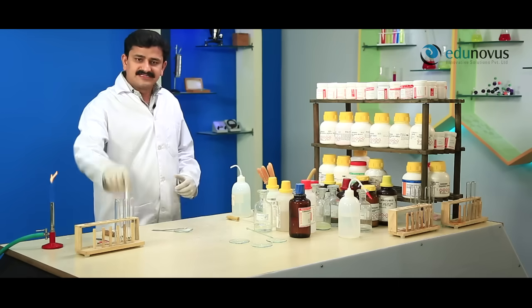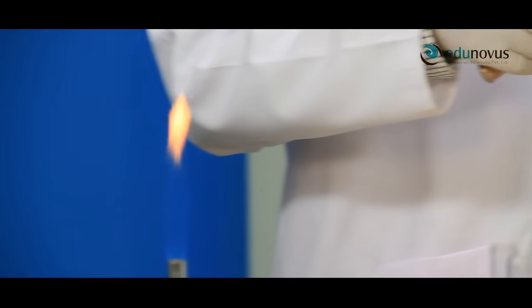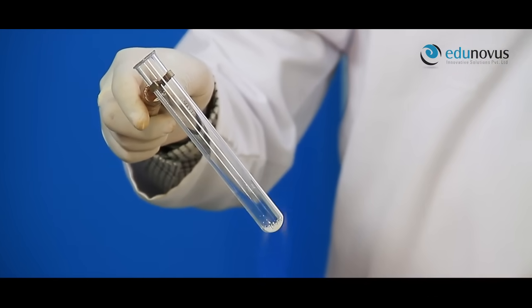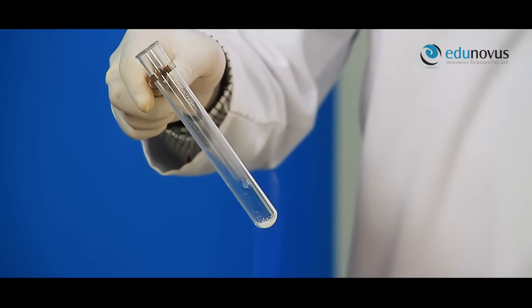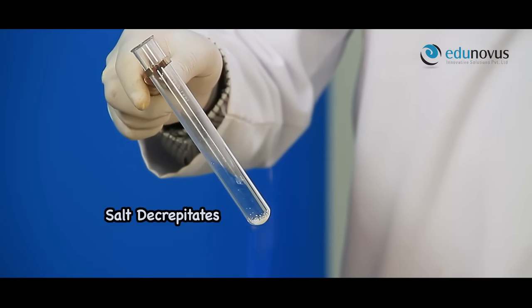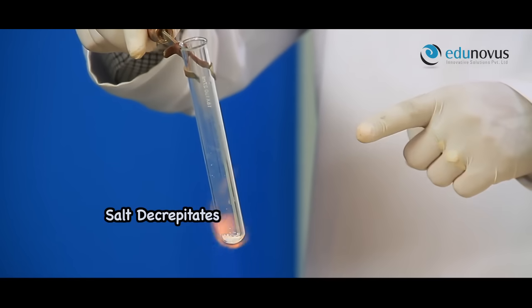Take a small amount of given salt in a clean and dry test tube and heat it using Bunsen flame. If any decrepitation of the salt is observed, it infers that this given salt may not have water of crystallization. Here you can clearly see the decrepitation of the salt.